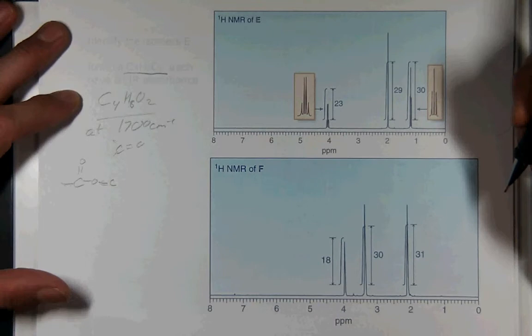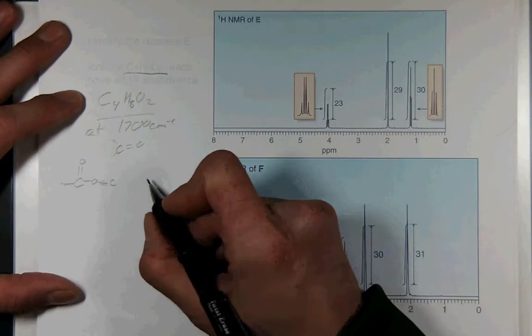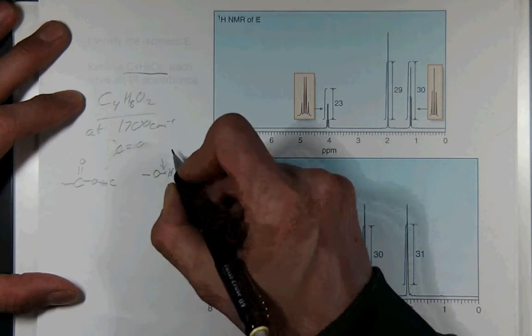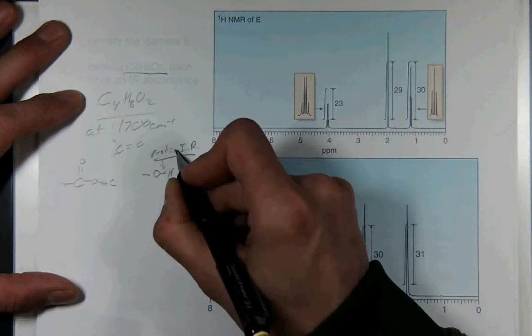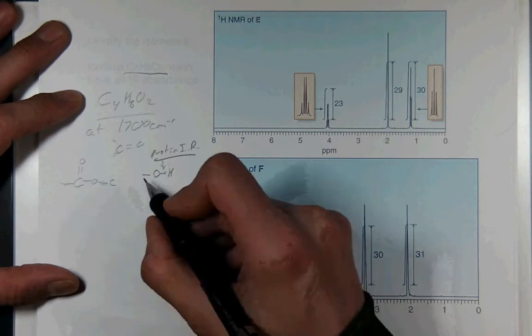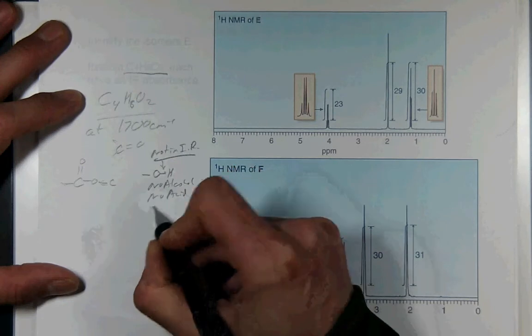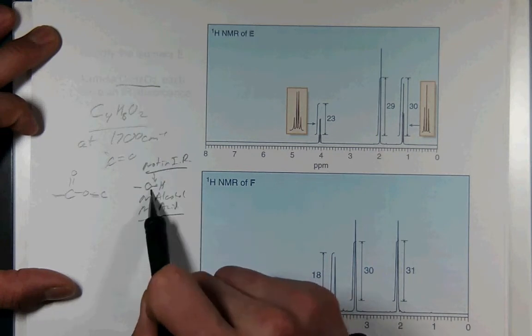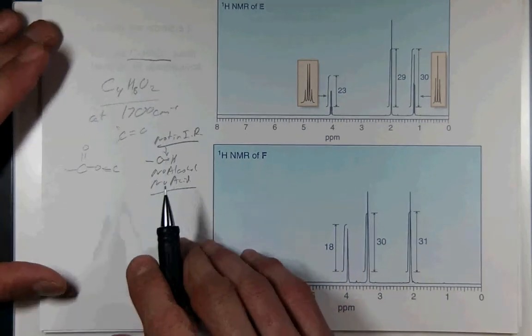They didn't mention in the IR spectra the broad peak that you would expect from the oxygen-hydrogen stretching. So this is not in the IR data. If they were to miss that, they would be really incompetent chemists. So let's assume there's no oxygen-hydrogen, so no alcohol and no acid. We can assume it's not an alcohol or an acid. Some kind of ester.